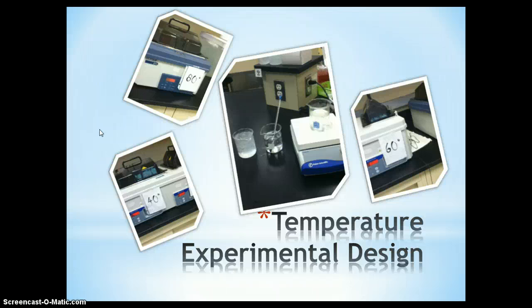So what we did was we put 1 milliliter of potato extract in each one of the tubes, and we put the tube in its designated temperature environment. For instance, test tube 1 was put in our 100 degrees Celsius environment.